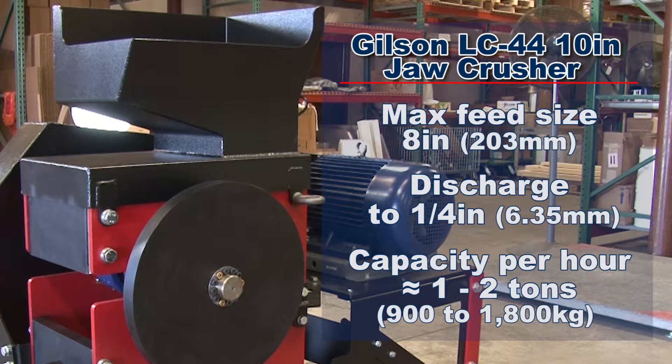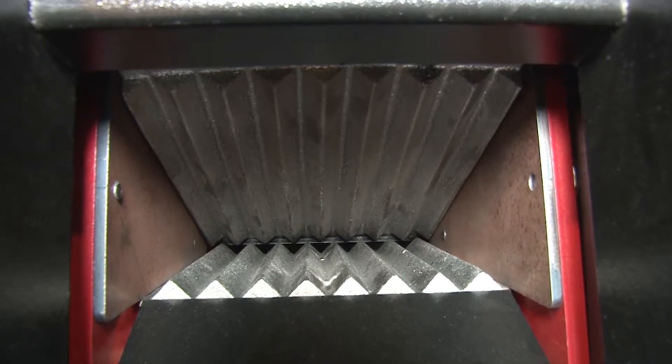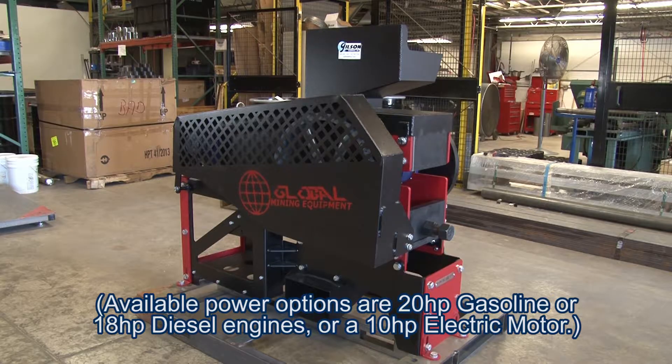Or like the Gilson LC44 10-inch jaw crusher, designed to take on large hardened rock and crush them down to one inch or smaller. This rugged machine's jaw plates facing material are hardened abrasion-resistant 450 Brinell hardness rated steel that can reduce large rock sizes in minutes.